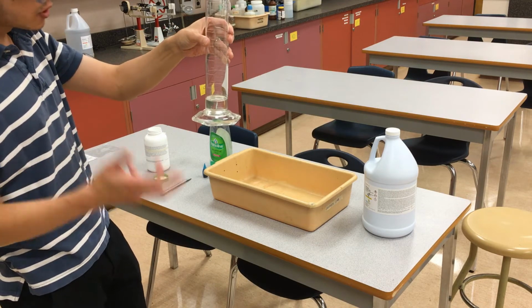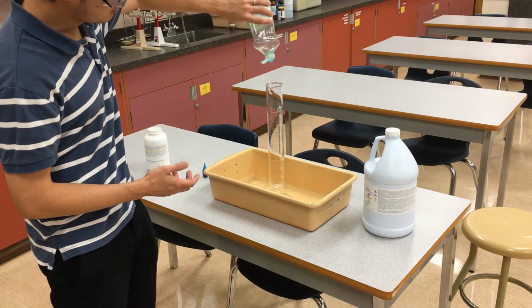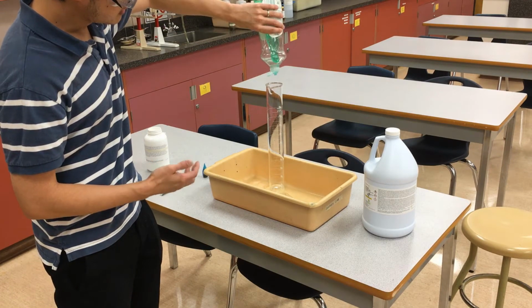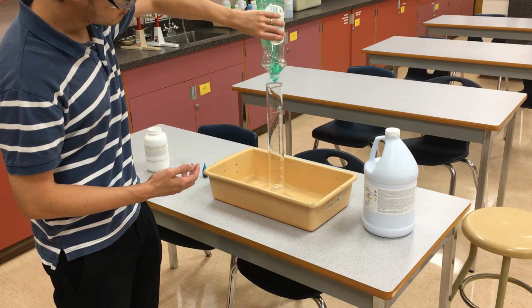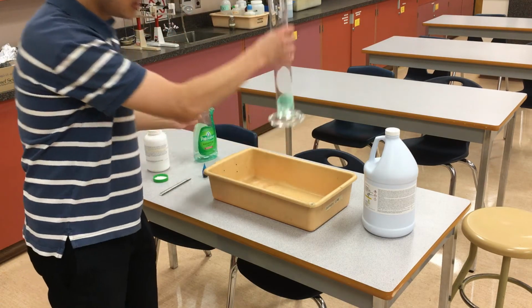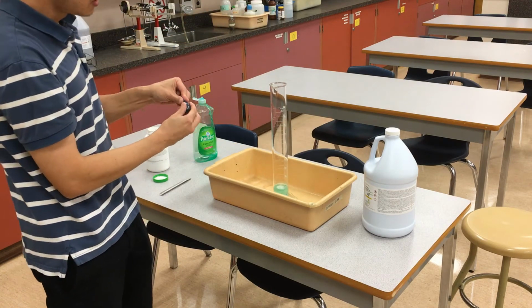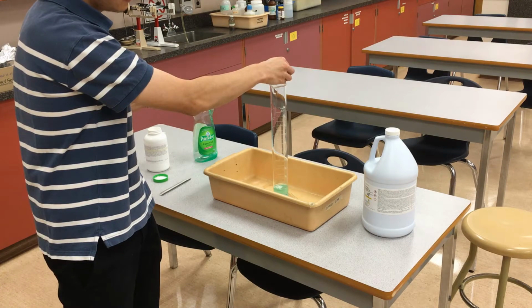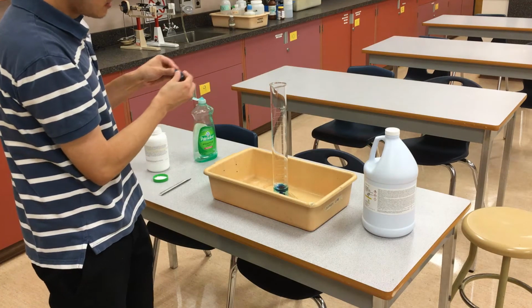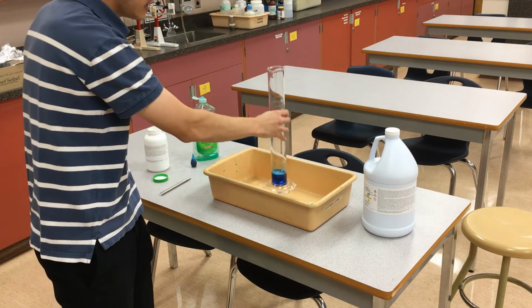What we're going to do, just for dramatic effect, is take some soap. Soap is going to add a few bubbles for us, that way when the gas gets produced, it can actually get trapped by these soap bubbles. I'm going to add these first, just to show you it's not the soap that causes the reaction to be faster. I even add maybe a drop or two of food coloring. So now I have a bluish liquid of hydrogen peroxide, right?